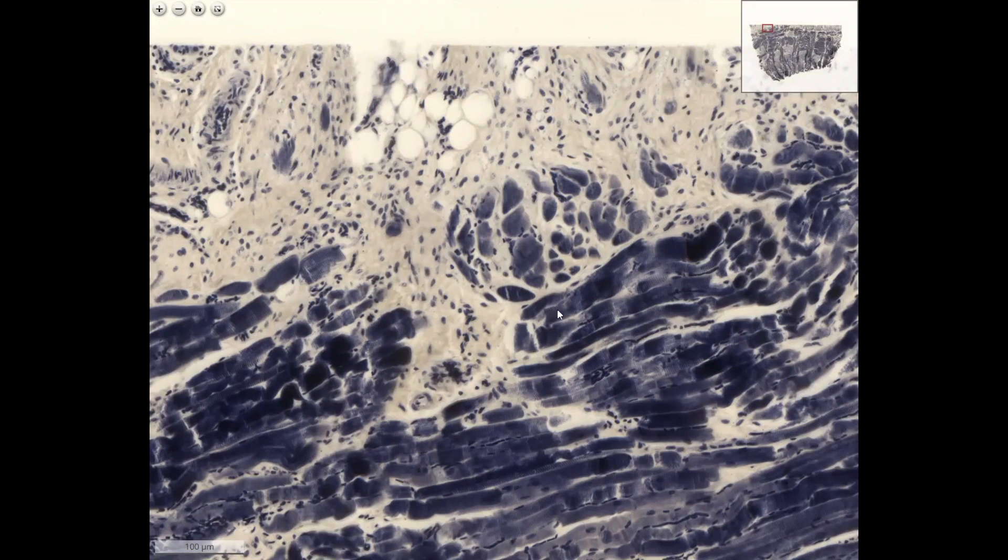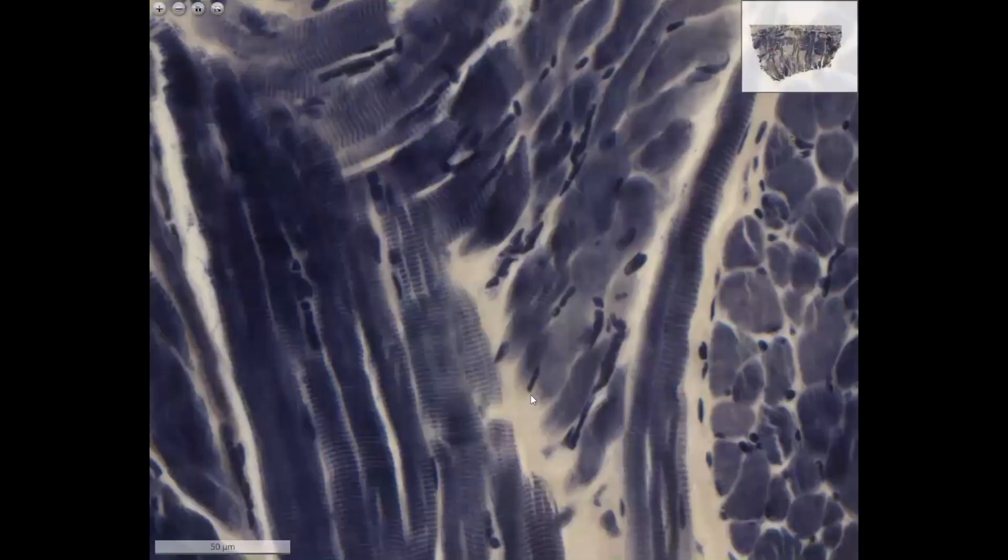The length of the skeletal muscle fiber, which is actually a multi-nucleated giant cell, may vary from a few millimeters to even 50-70 centimeters. The nuclei of the skeletal muscle cells are pressed to the side of the muscle cells. They are positioned right under the sarcolemma.